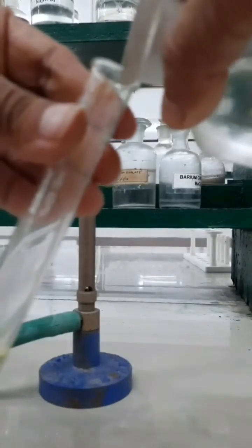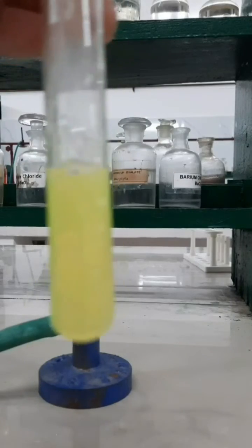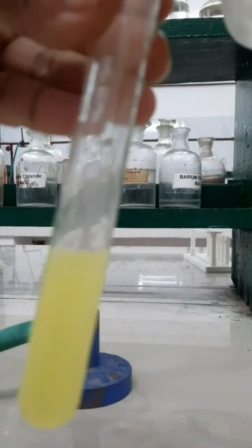After this, you have to add lead acetate solution into it. After adding lead acetate solution, a yellow precipitate of lead chromate will be obtained, and that will confirm the presence of chloride ion.